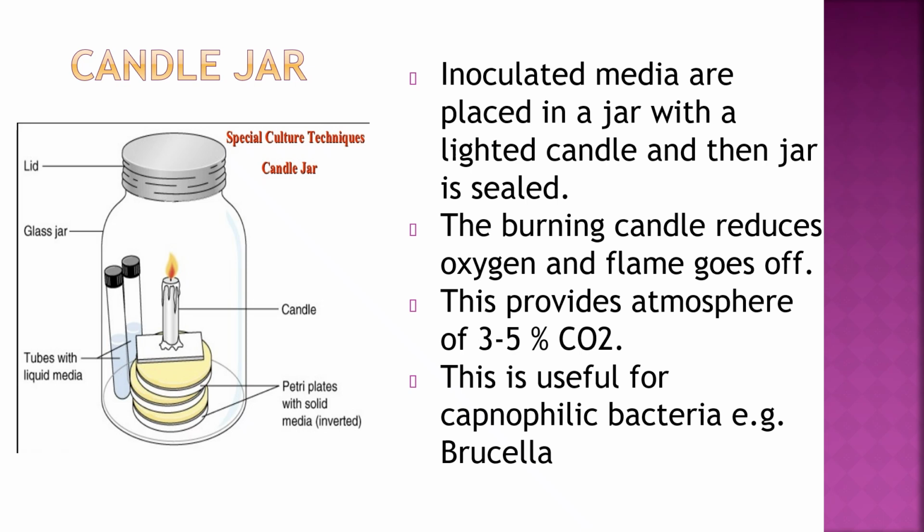So what do we mean by capnophilic? Bacteria which grow in the presence of 3 to 5% CO2 are called capnophilic bacteria, and an example is Brucella. In this diagram you can see the jar plus inoculated plates and then the candle.